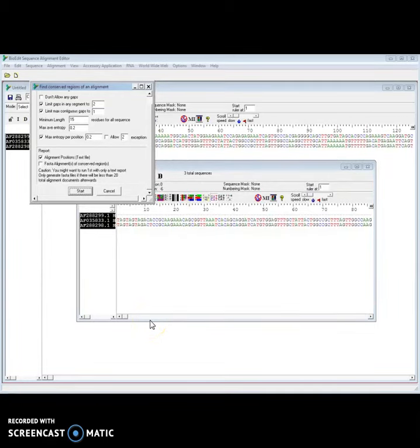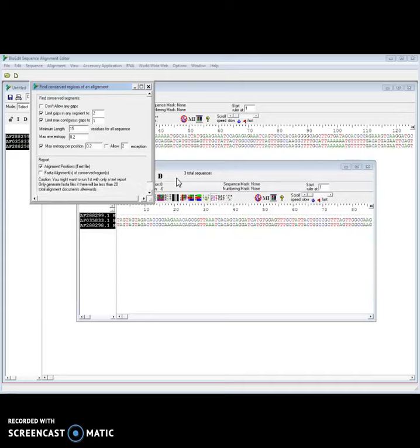If you encounter sequences that have conserved regions, you can use this for real-time PCR and probe design. It will serve as a template for that. You would just need to check its specificity by the region, and you could use the nucleotide BLAST in this software.